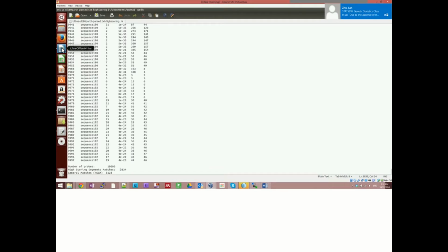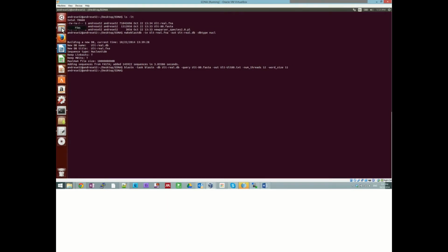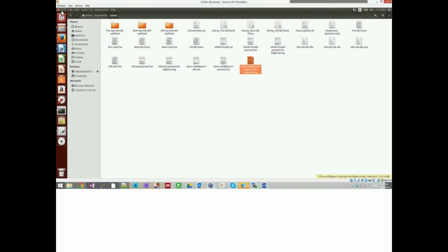Okay, so let me go back and check if it's done. So in this case, it's done, and I would have the same file here I was showing you. So if I go to the desktop, I have EDNA here.